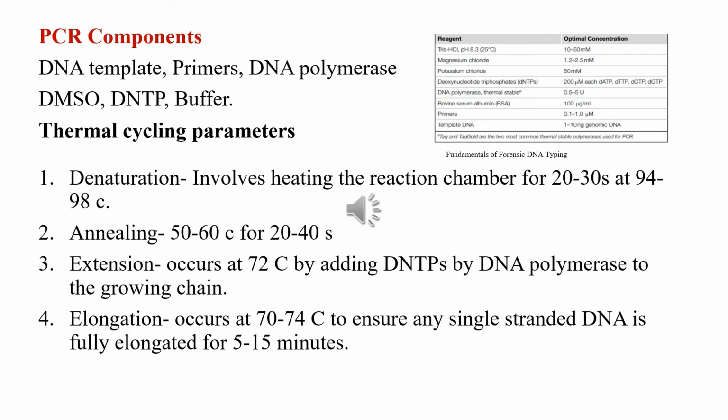There are several different PCR components needed for a PCR reaction. The most important parts of a PCR reaction are a DNA template, a primer, DNA polymerase, dNTPs, and buffer. The other variables that can be included in a PCR reaction are given in the table.